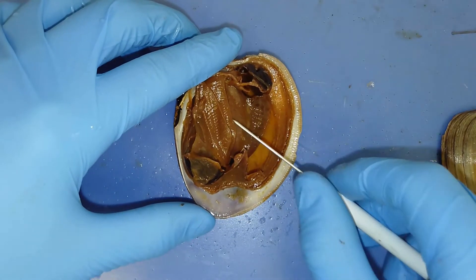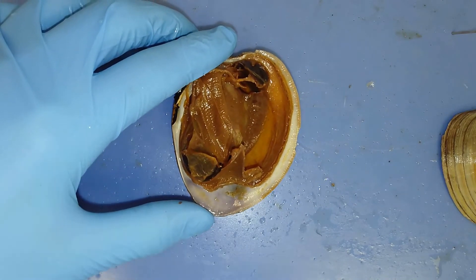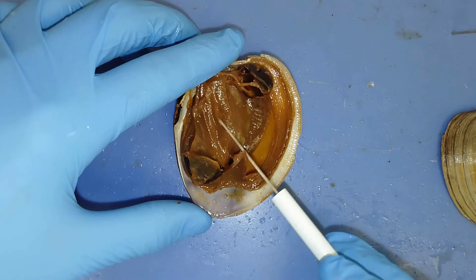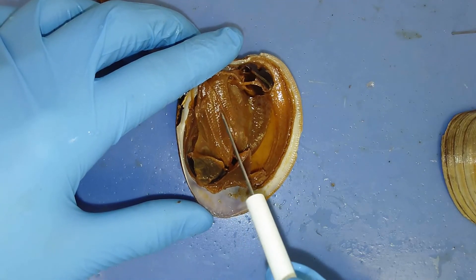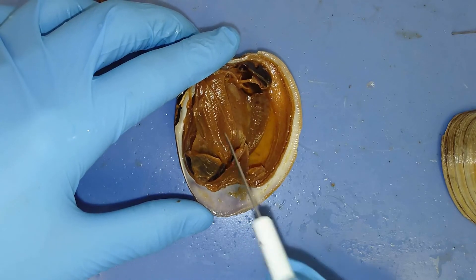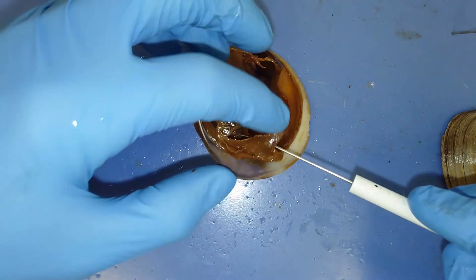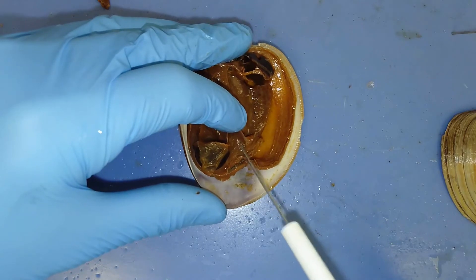Going back to the gills — these are extremely thin and are used to pass oxygen directly from the water into the bloodstream of these organisms. They have really thin lines on them, increasing surface area with a very small amount of tissue. Food is also being trapped in these gills. These small triangle structures act as a comb, scraping away food particles and pushing them towards the incurrent siphon. Food gets trapped in the gills and is pushed towards the mouth with this labial palp.